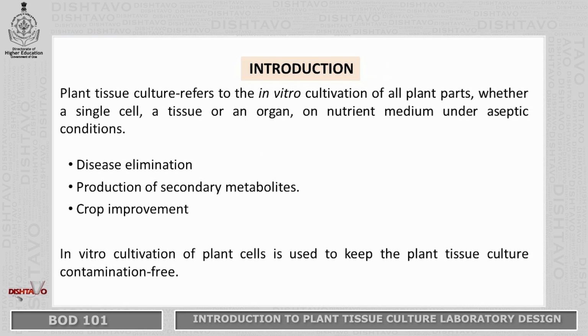So what is plant tissue culture? Plant tissue culture refers to the in vitro cultivation of all plant parts, whether a single cell, a tissue, or an organ on a nutrient media under aseptic condition.